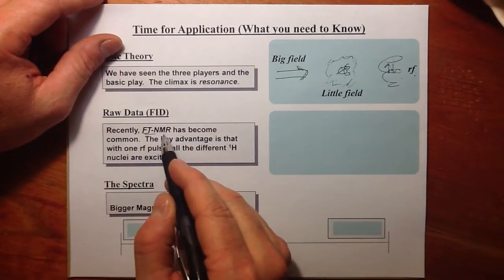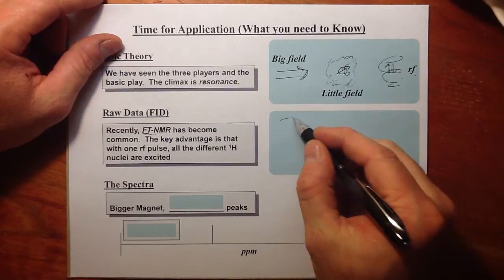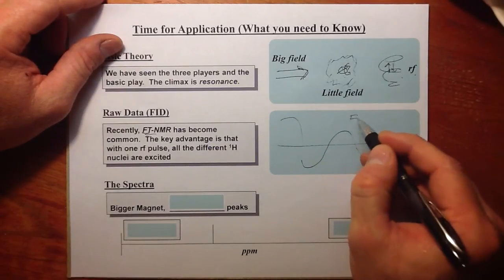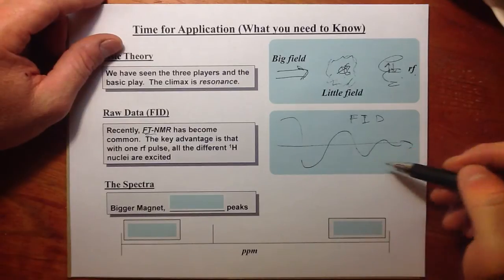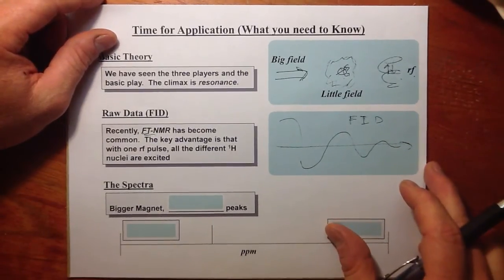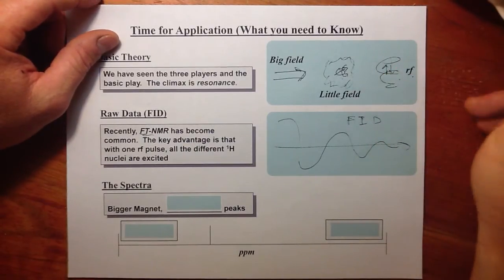It's Fourier transform NMR, where everybody gets excited all at once. And we get then a signal, it's called the FID, free induction decay signal, where when these relax back, the magnetic moment as it relaxes back gives us a signal we can work with that tells us what the frequency of precession was for each proton.